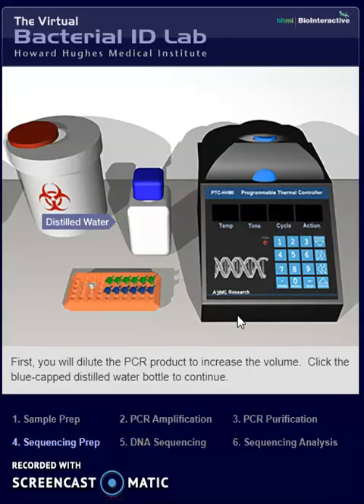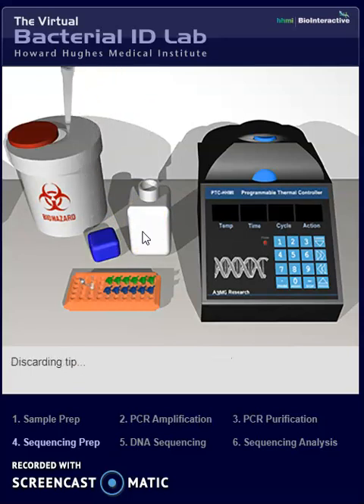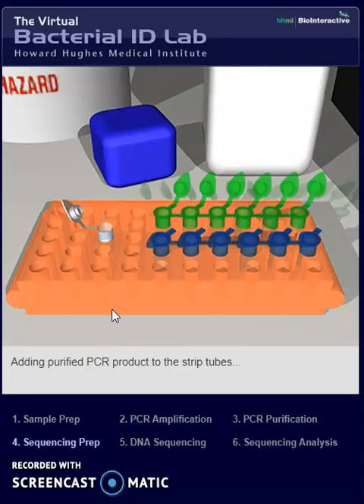Now we will do step 4, which is sequencing prep. First of all, we should dilute the PCR product to increase the volume. Adding distilled water to the purified PCR product. The green and blue strip tubes already contain PCR reaction mixture in them. Adding purified PCR product to the strip tube.